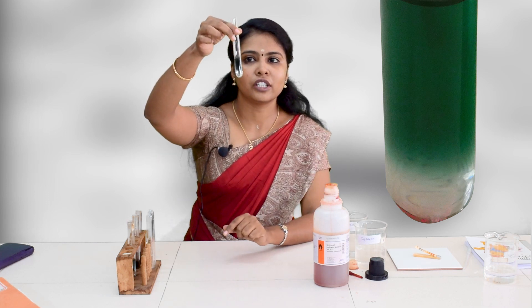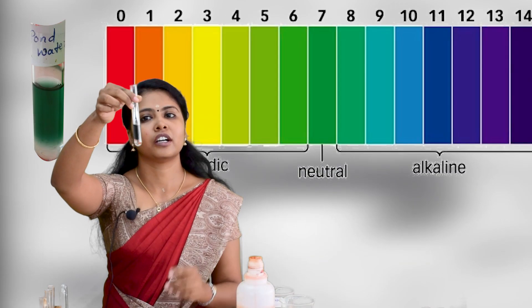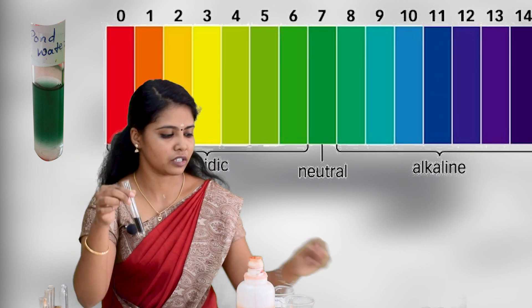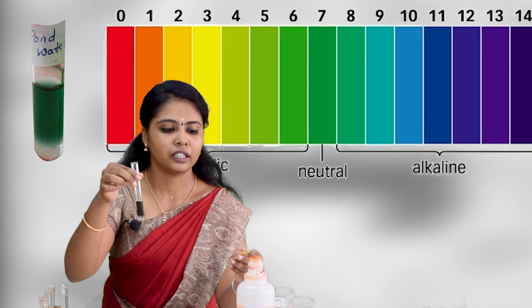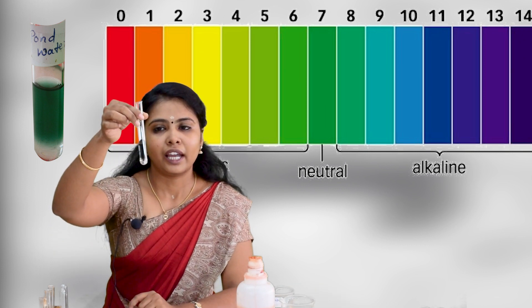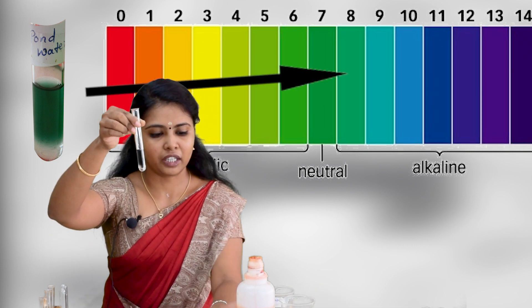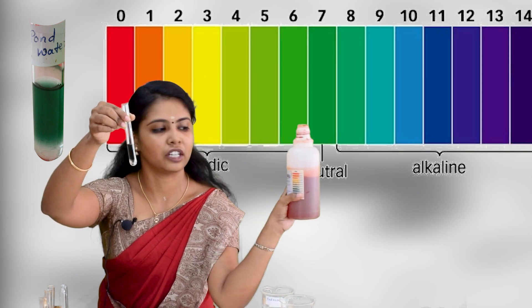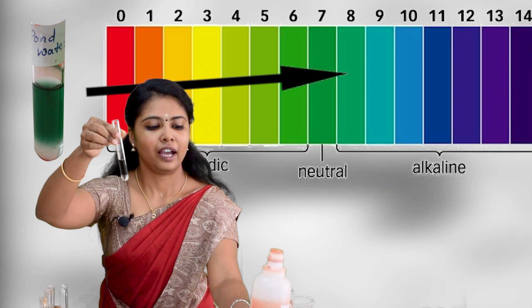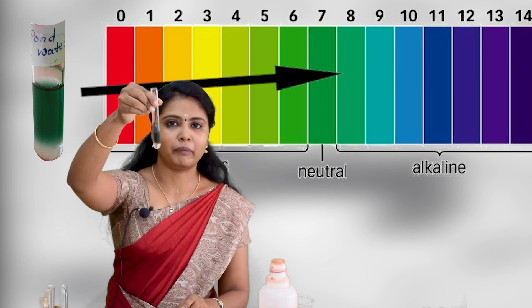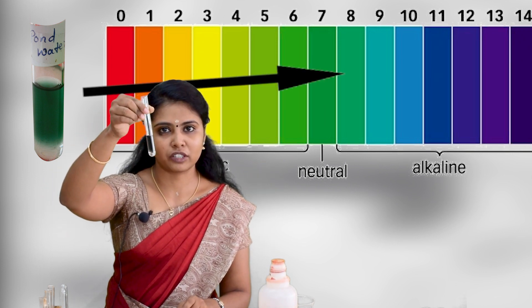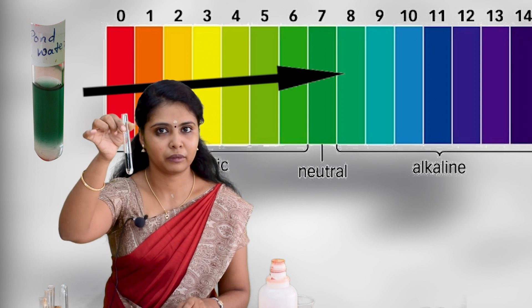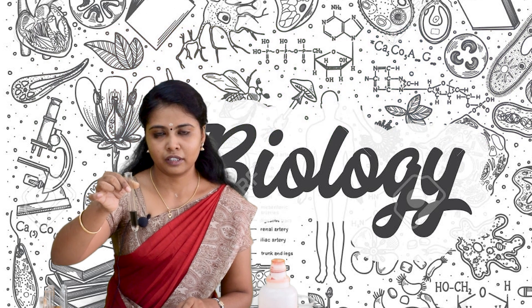Now, refer to the pH values and corresponding colour changes. You can see the green colour represents approximately pH 8 to 9. Just observe the pH colour change and the value of pH — this colour indicates the pH is 8 to 9.